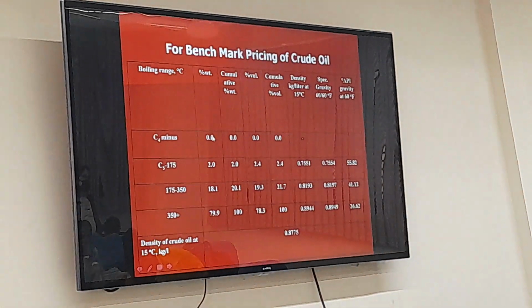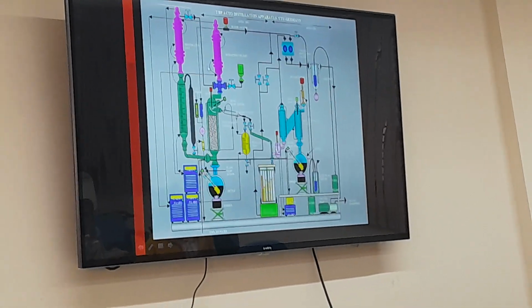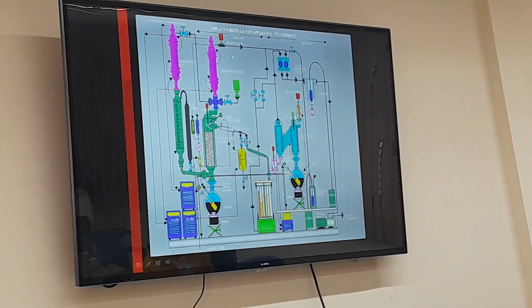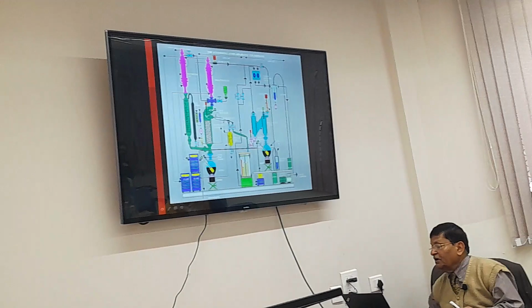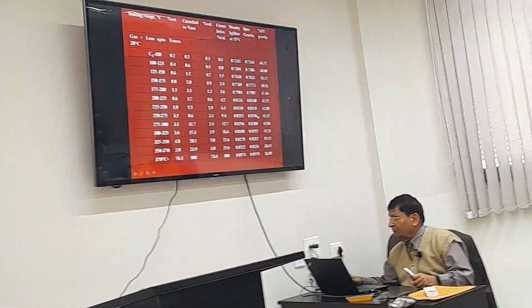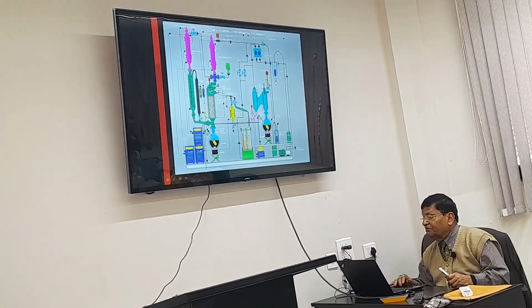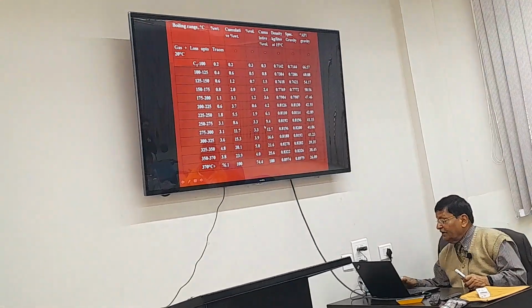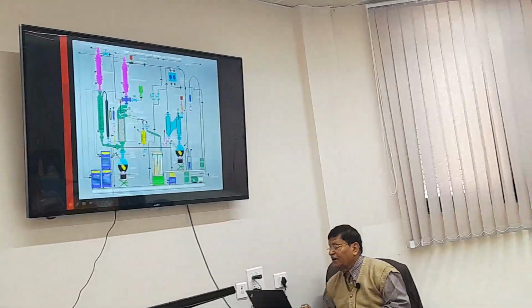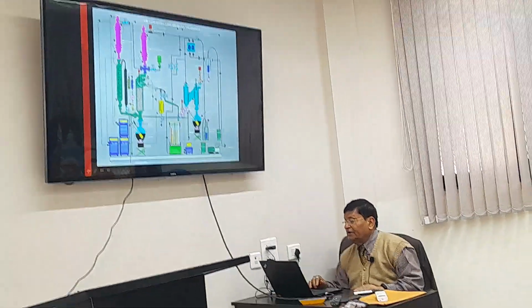From the column, it is going to the fractionating column, where you are collecting the fractions. This is the fraction cutter, and this is the vacuum distillation unit, where we are transferring the charge of RCO. Here we are collecting the different fractions. Receiver, turntable. So here we are receiving oil. This is the vacuum pump. The vacuum pump is applying the pressure to the whole system.